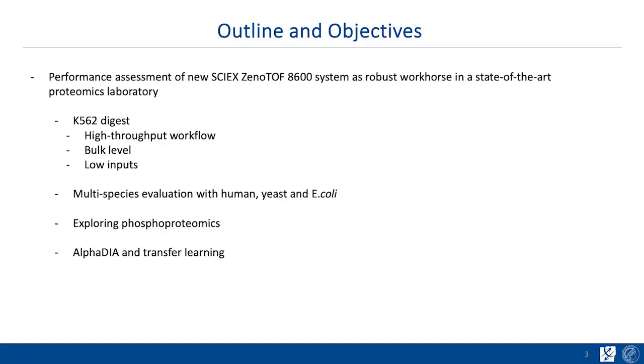And lastly, we want to apply our software, mainly AlphaDIA and transfer learning, to get the most out of this. And I'll give a brief outlook at the end of my talk.